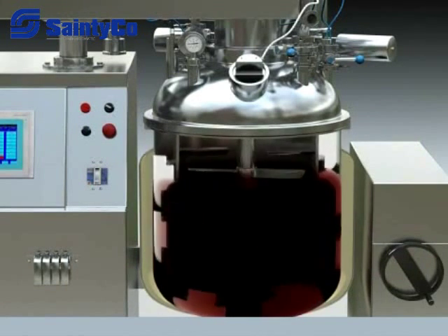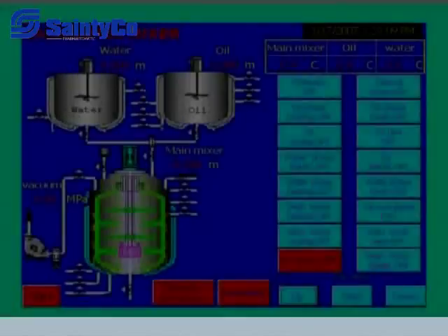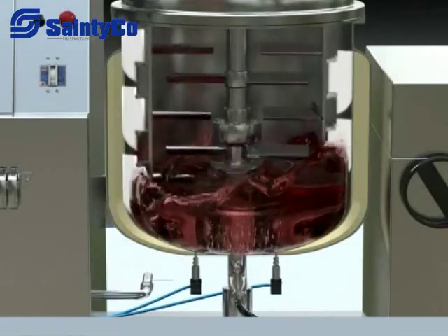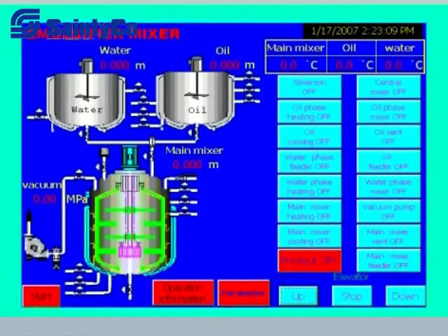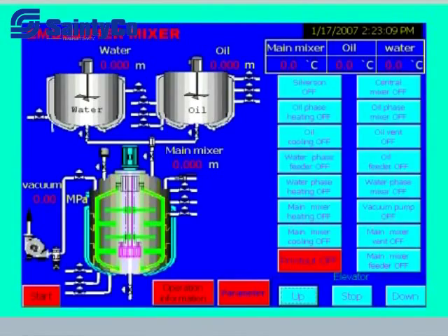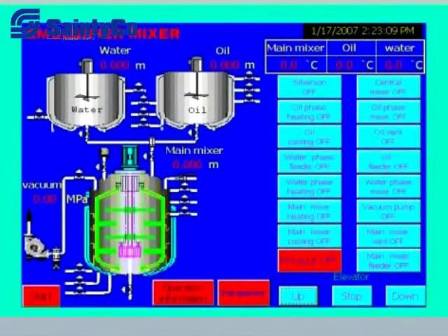7. Close the feeding valve of the main tank and the valve at the bottom of the oil or water tank, then touch the vacuum pump stop button on the touch screen and start low-speed mixing of the main tank on the touch screen. 8. Touch vacuum pump on the touch screen and start the bottom valve of the main tank when vacuum degree reaches 0.06 MPa. The powder will be sucked into the main tank through a soft pipe under the negative vacuum pressure. Close the bottom valve of the tank and stop the vacuum pump after powder feeding. Then touch the vacuum valve on the touch screen to enter the next procedure. 10. Start main tank heat on the touch screen after powder has been sucked, and start emulsifying and mixing after temperature meets the technical requirements, then continue with the next stage.